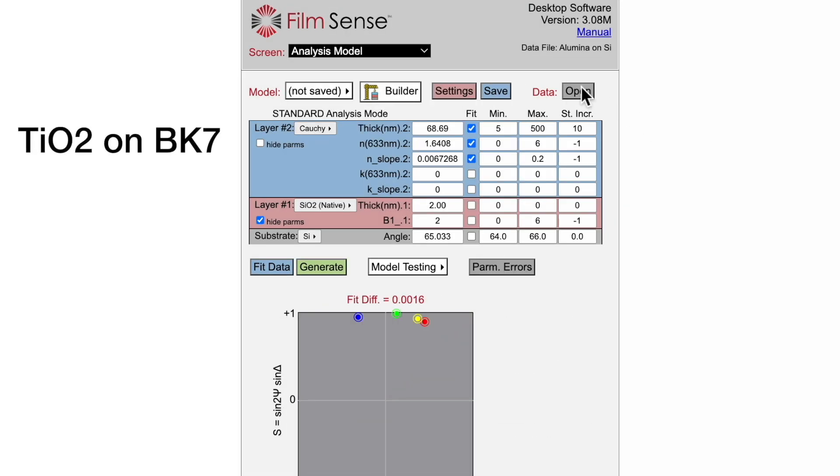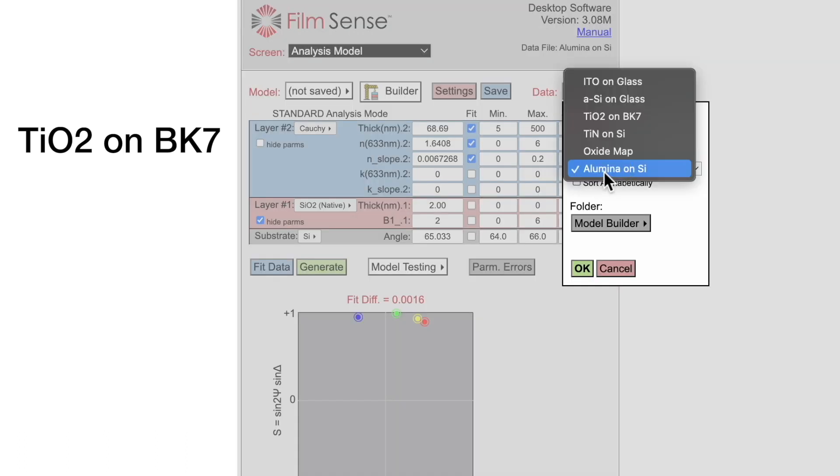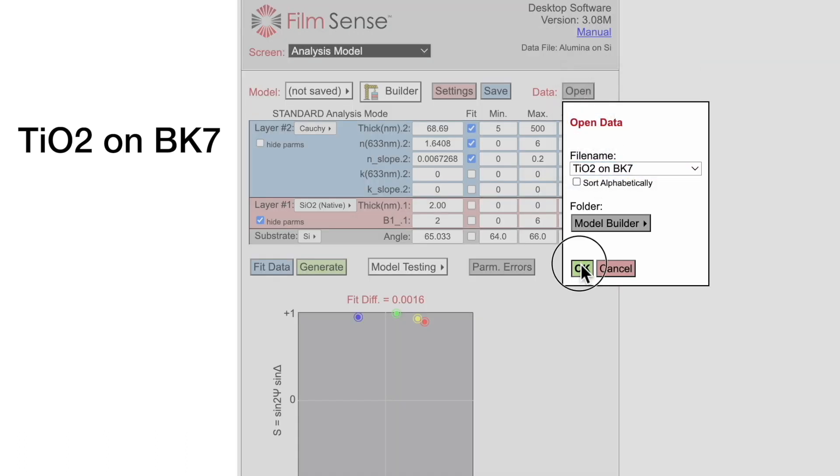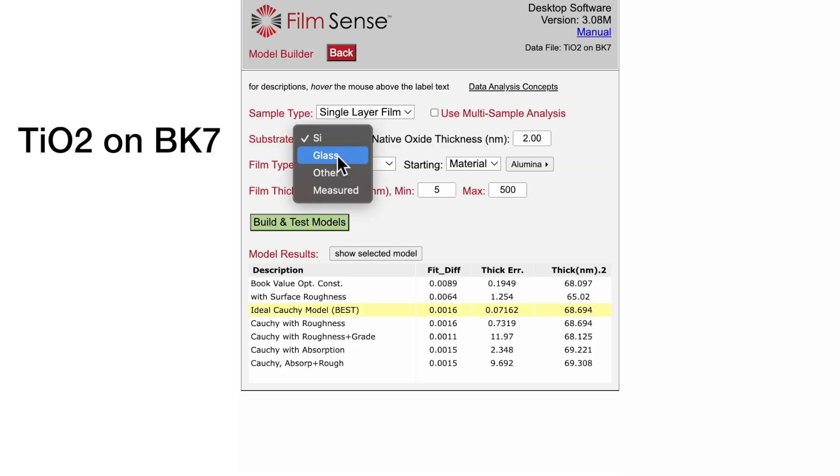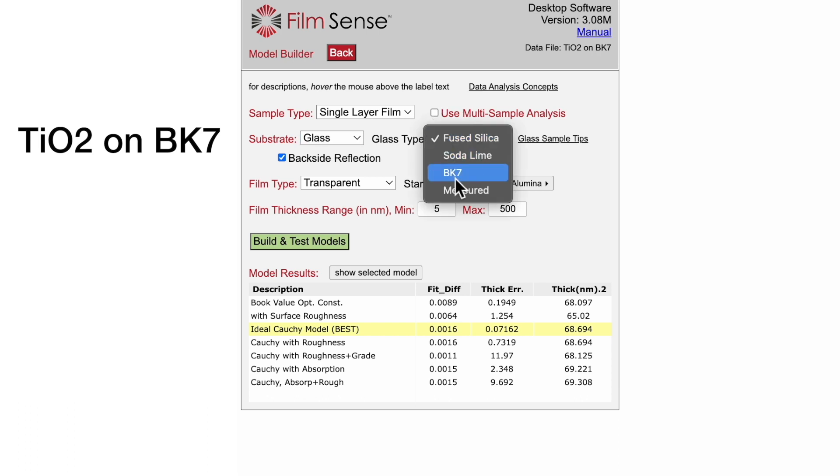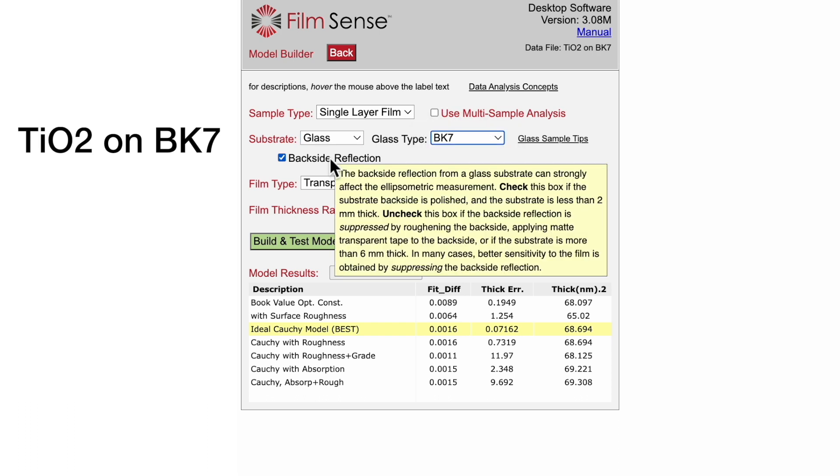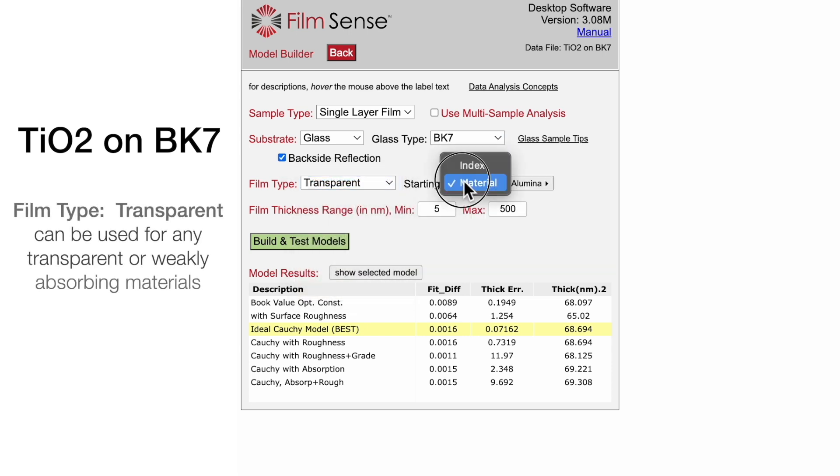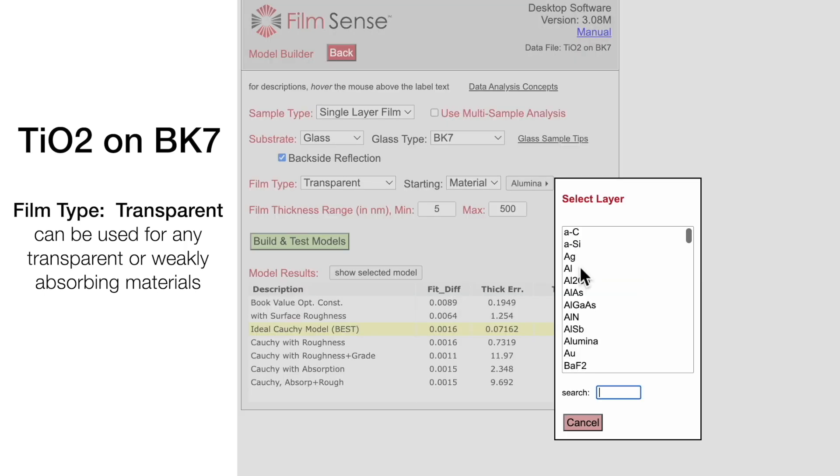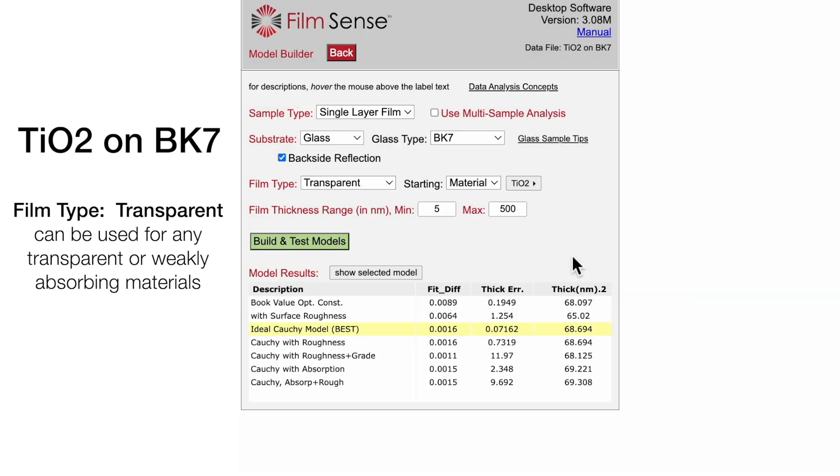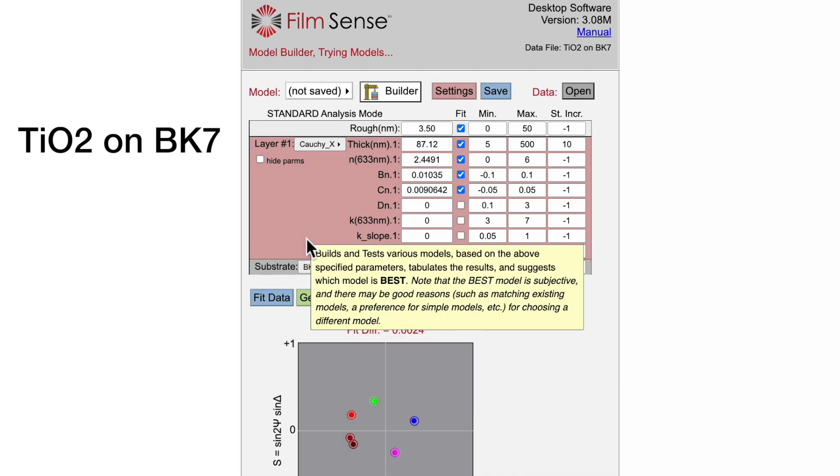For our next example, we will use a titanium dioxide on BK7 glass sample. Start by selecting a glass substrate with a glass type of BK7, and since the substrate was thin, the backside reflection box should be checked. The film is transparent, and the starting material is titanium dioxide. We will use the default thickness range of 5 to 500 nanometers, and then build and test models.